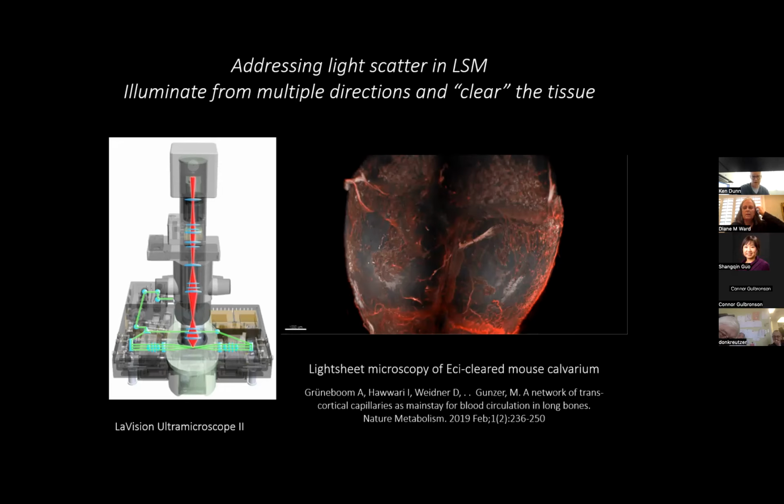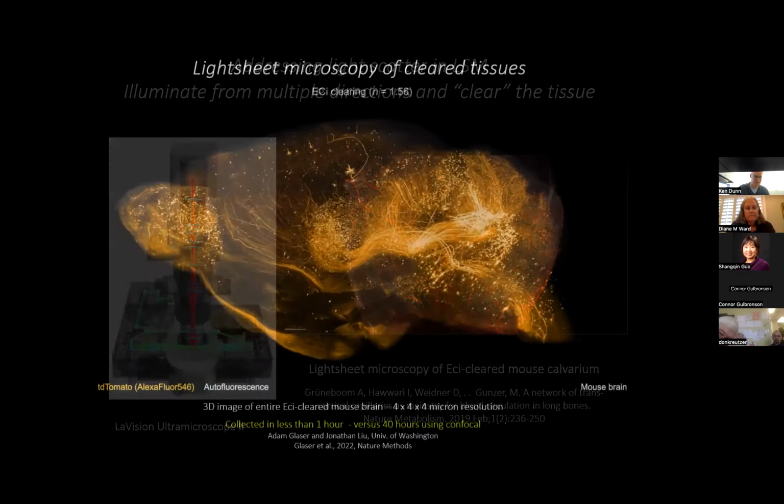What Diane's alluding to here is that it's all very fine to have a tissue that is millimeters by millimeters by millimeters and image it, but how do you get antibodies into it? And how do you rinse them out again? And how do you put the next set of antibodies in? You rinse those out. So there are challenges to how you actually label these tissues. One of the ways of doing it is using the animal's microvasculature to label the endothelia. So pretty much every volume I show you, we think, has endothelia because you're cheating. You're using the perfusion to label it.